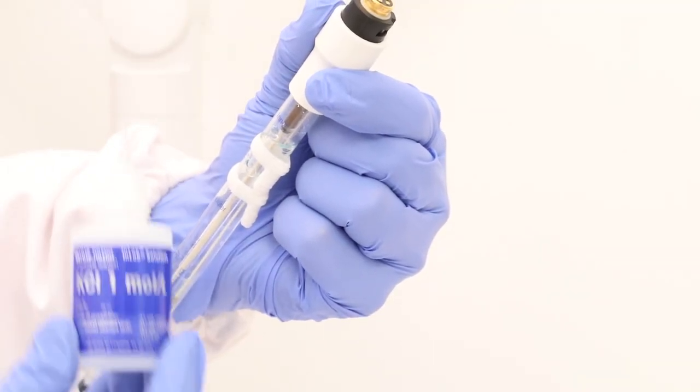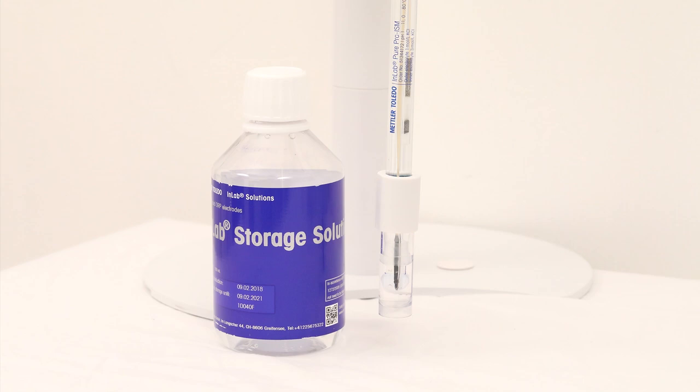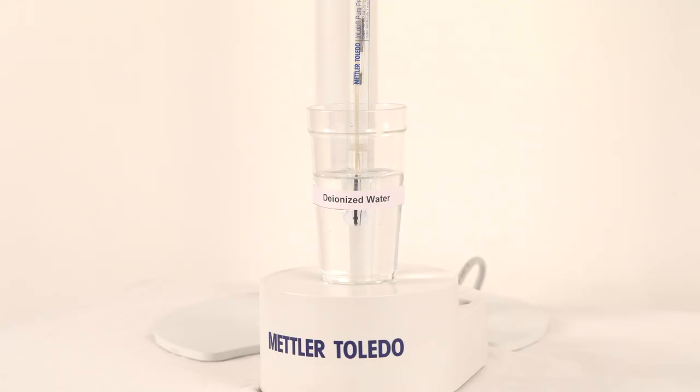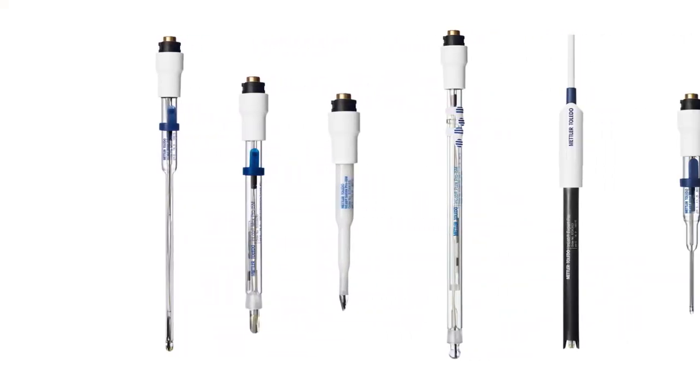Regular maintenance is very important for prolonging the life of a pH electrode. The electrolyte needs to be refilled regularly. Store the electrode in InLab storage solution; prior to usage, keep it in pure water for one minute and rinse it well. Make a proper choice of electrode for your application to achieve better accuracy.